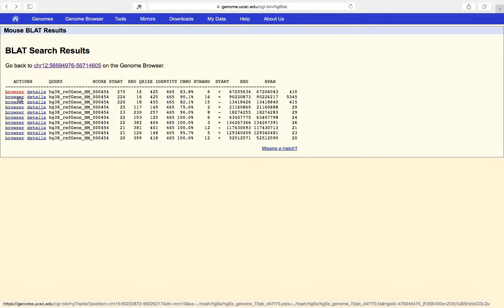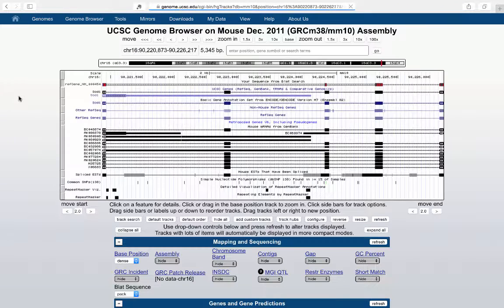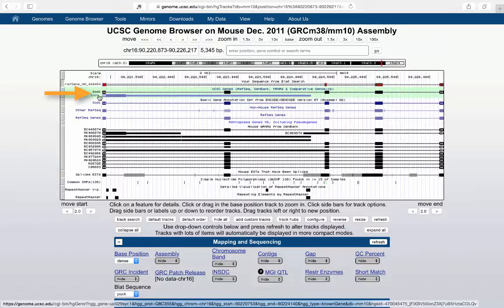Looking at the second hit — the much longer one — we find the actual SOD1 gene in mouse. This is the mouse homolog of the human SOD1 gene, as expected from a proper genomic alignment rather than the retrotransposed pseudogene found in the first hit.